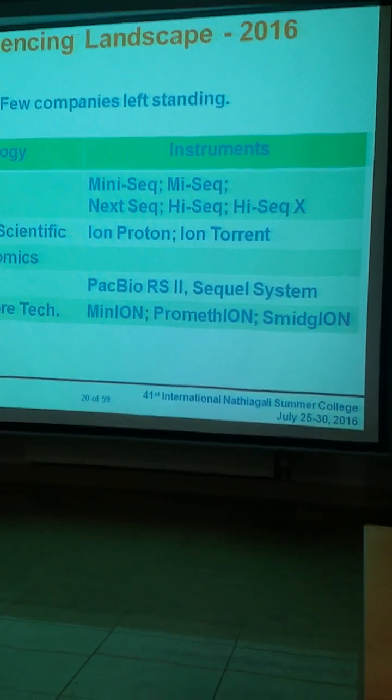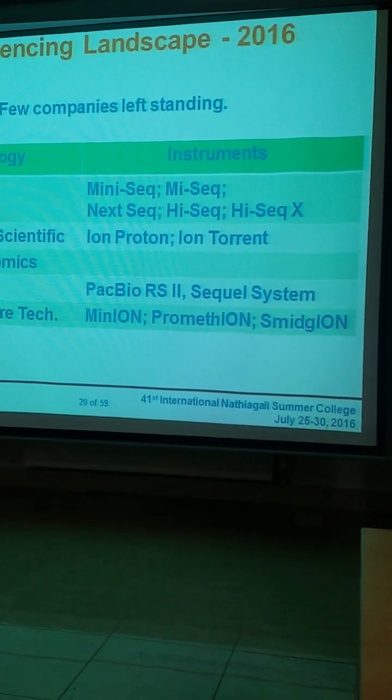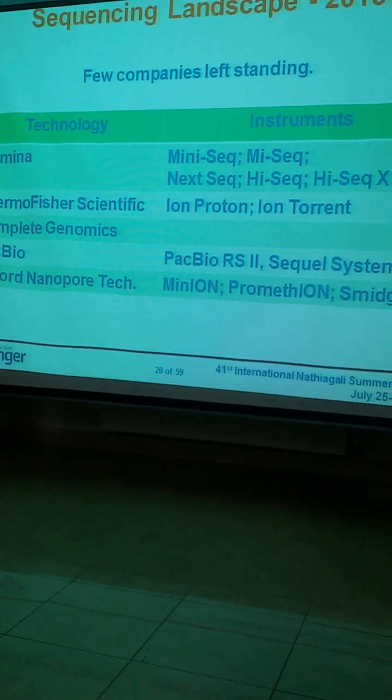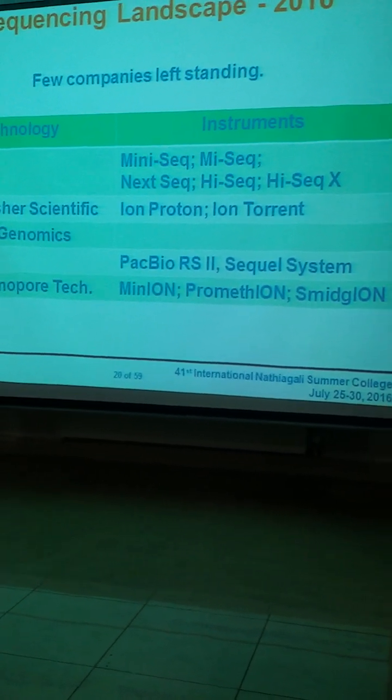The other thing you have to remember with these sequencers is that if you've got long tracts of A, C, T, and Gs, they're not very good at detecting those, and you get lots of errors in those positions.